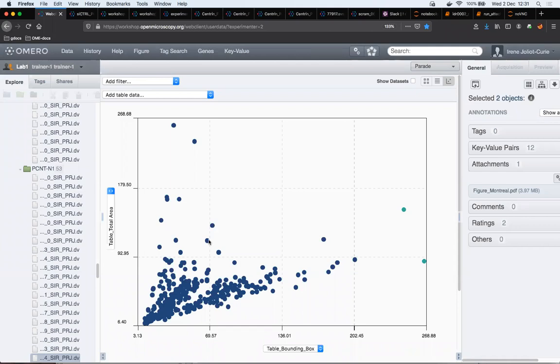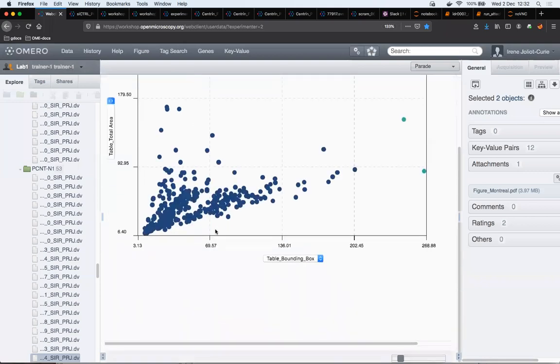It allows you to create publication figures for presenting in a scientific journal, but even more modestly, if you just want to show data quickly to your boss or at a lab meeting, then indeed you can do figure creation in this very quick manner, which we will just demonstrate as we go.